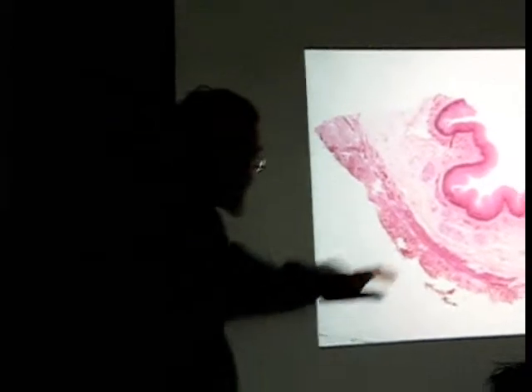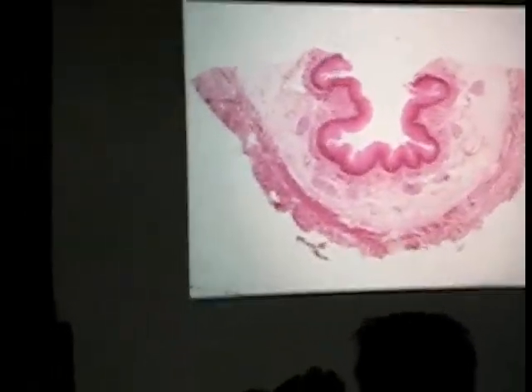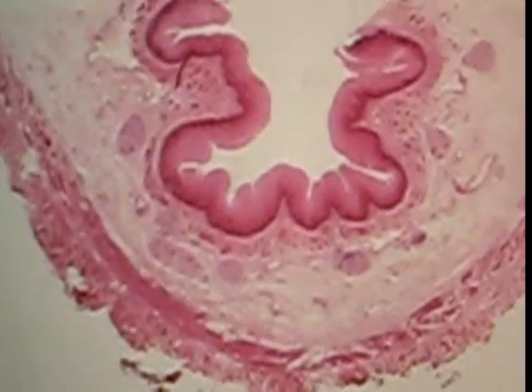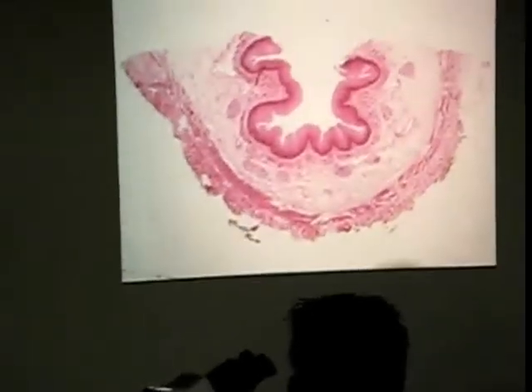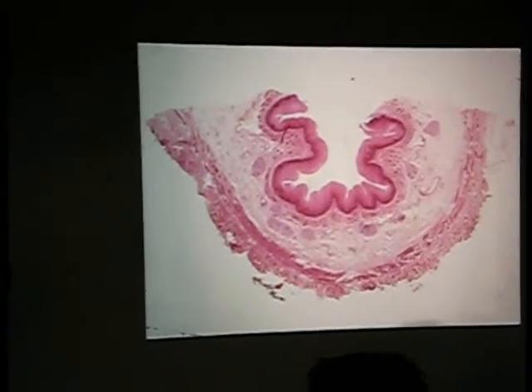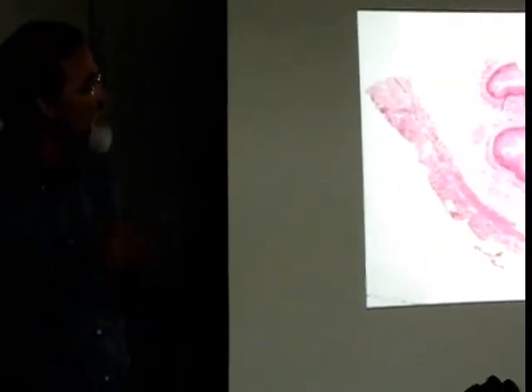Okay? So, what do we think these are right here? Yeah, esophageal glands. All right. At this point in the course, again, as I said in week 1, if you see a tubular profile, the first question you've got to ask is what kind of epithelium is lining it, right? If the epithelium is simple squamous, and you've got other clues like red blood cells, you know you're looking at a blood vessel. If you're seeing something that's simple cuboidal, you've got to start thinking gland or duct, okay?